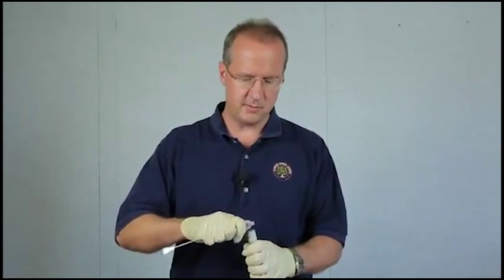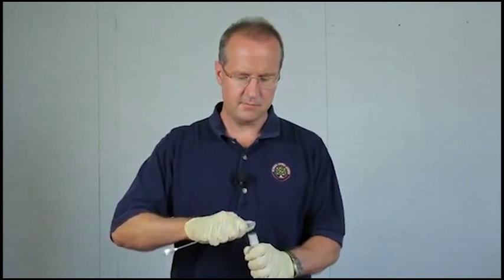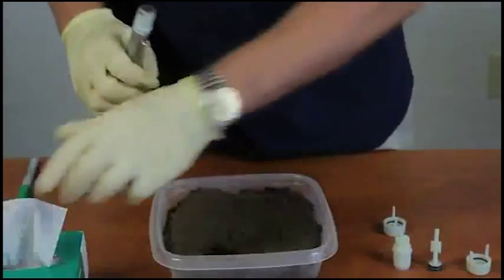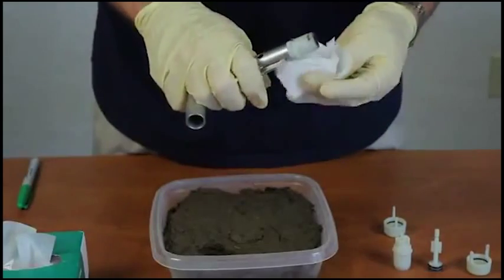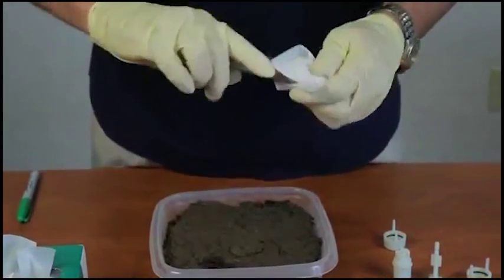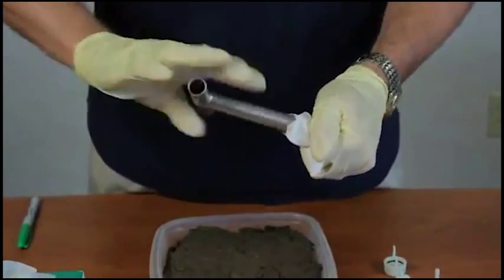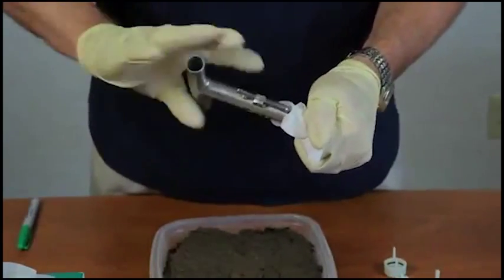You want to take a spatula. You'll want the sample to be flush with the top of the sampler. You want to take a wipe.